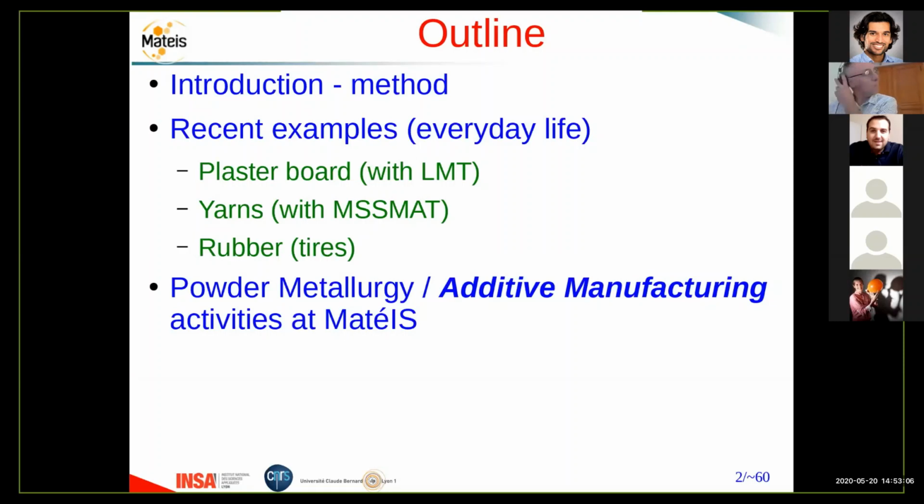So to make identification of, let's say, behavior, it's much easier to have simple analytical models and go fast. And here there is no real need for detailed observation of the microstructure and dialogue between the heavy finite element calculation that you can make based on the image and the detail of the microstructures.